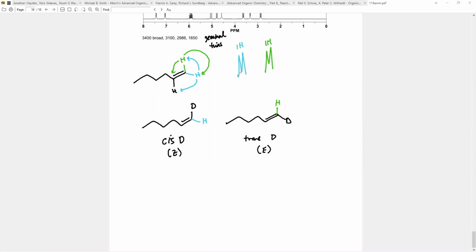Sometimes though, if there is no proton here, I think I showed this too, if we just have these two protons here, we'll see really nice singlets for them. It's because, in reality, their splitting is so small that we don't really see it with our visible eye. You have to really zoom in. If you zoom in, you'll see them split a little bit, but you have to really, really zoom in, right? And not everyone's going to have a microscope or a magnifying glass available to them during the exam. But that was just something cool that I wanted to mention. Cool, right?